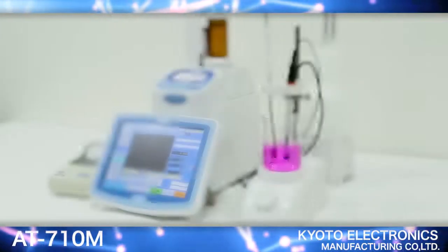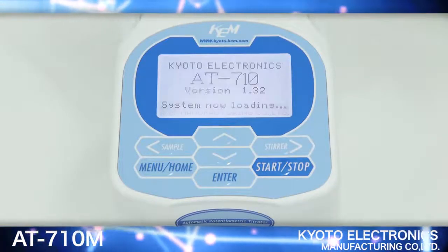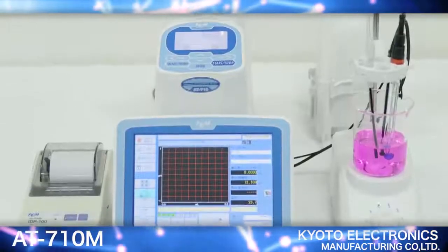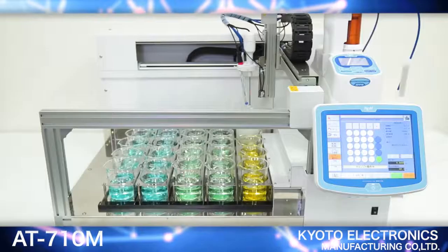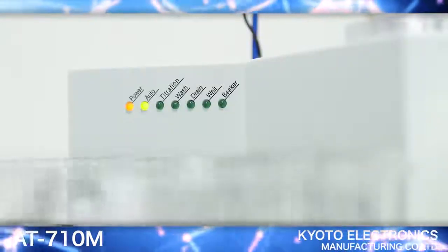It also supports wireless and LAN connections. Furthermore, by combining the AT710S or M with a multi-sample changer, you will be able to substantially increase productivity.